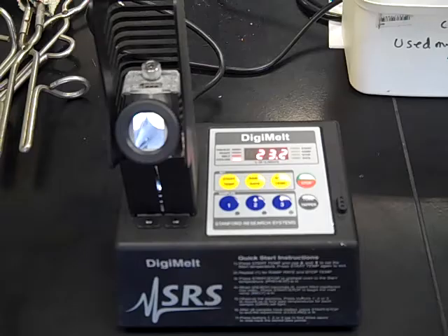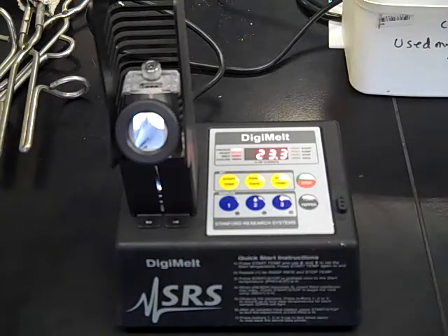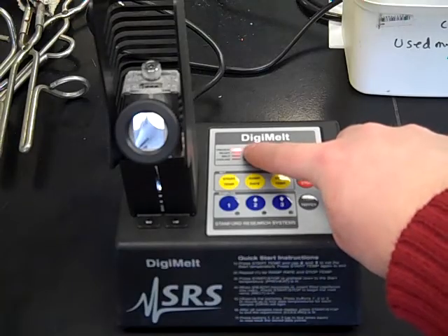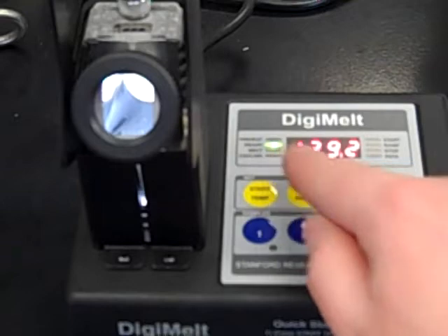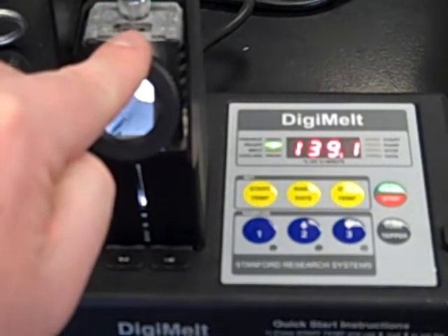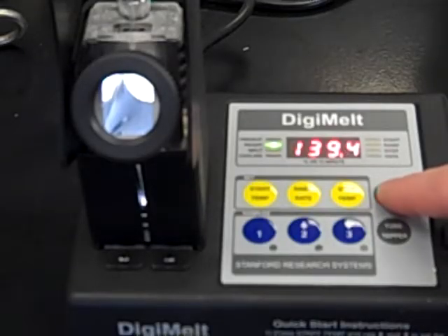Once you've set your start, stop, and ramp, click the start/stop button. When you click that, it's going to start preheating the oven, so it'll take a while to warm up. Then in a minute, the ready button will be lit. You can see we're up to our start temperature of 139 and the ready light is green — at this point we're ready to insert our samples into one of the three holes at the top. I put my sample right in there, and once inserted, press start/stop and it will begin the ramp.